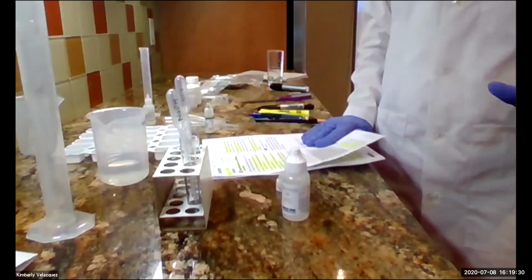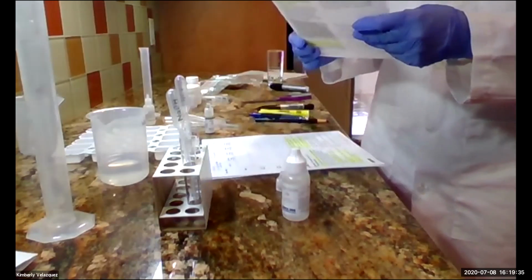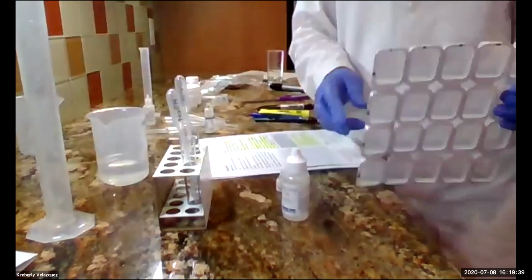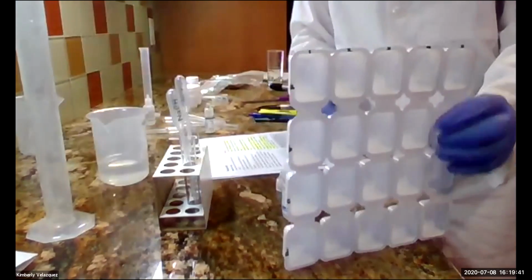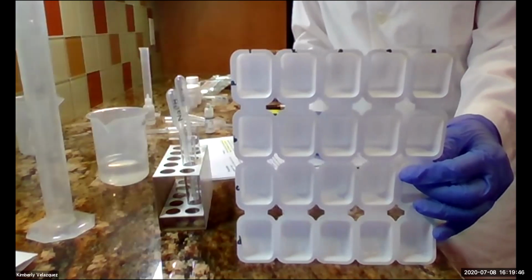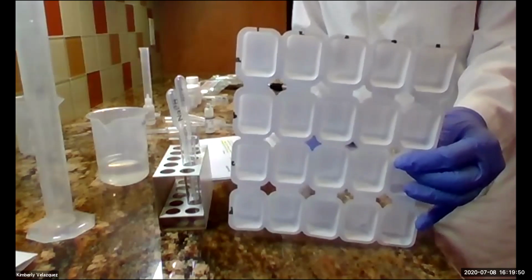All of that we just did was all just prep. Also in your prep, you need to label your tray. Okay, so there's a picture showing you how to do that. You're going to label 1 through 5 across the top and then A, B, C, D along the side.